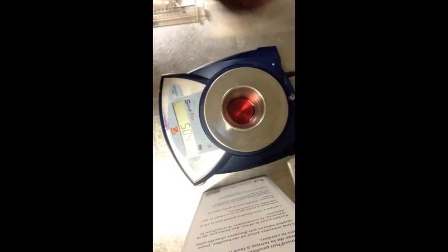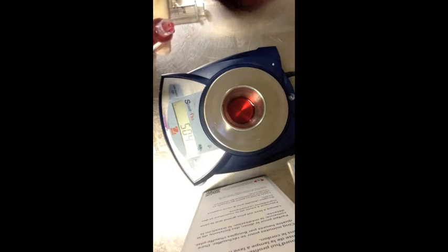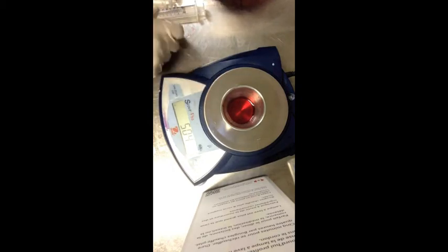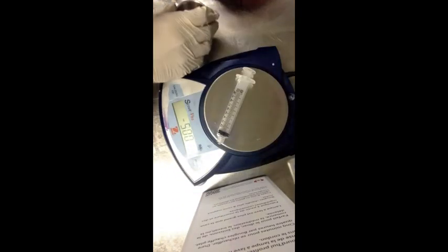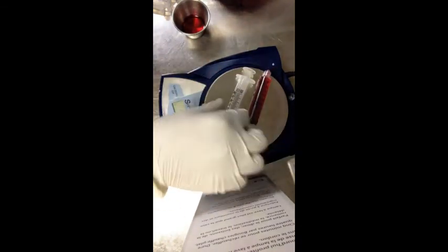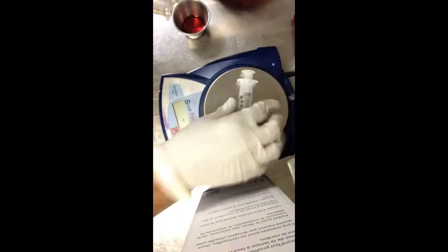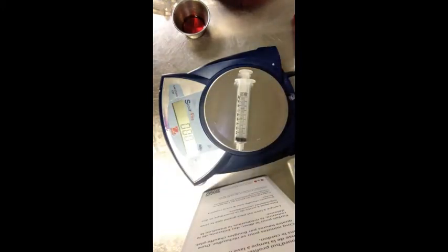Let's take that off. There's always a little air that needs to be burped out. And then a cap can be put on. Let's see if we can get some idea of how much we put in there. So it says 10.16 but let's try this one again. That one we know is at 0.